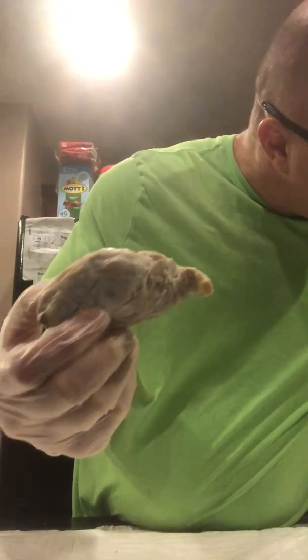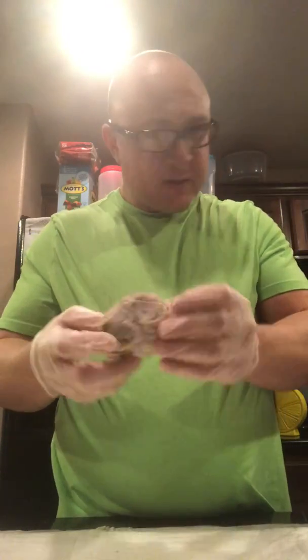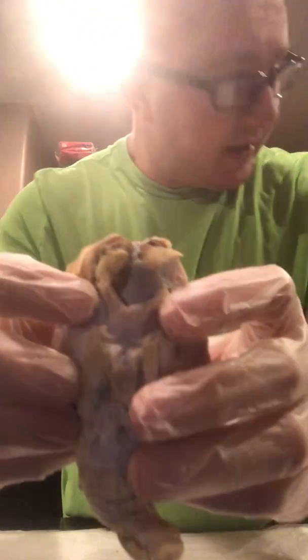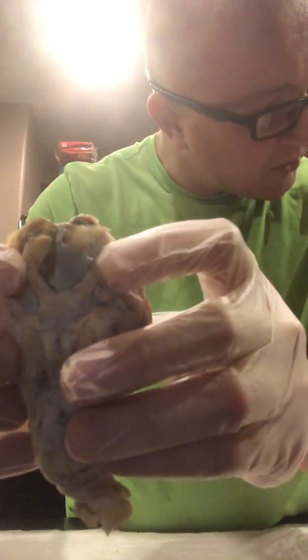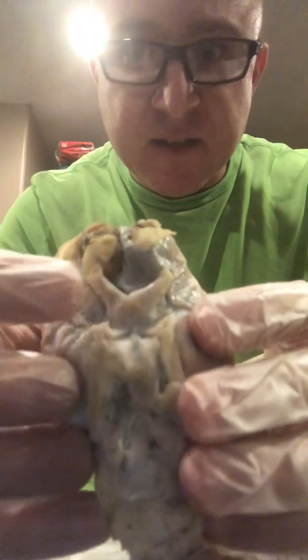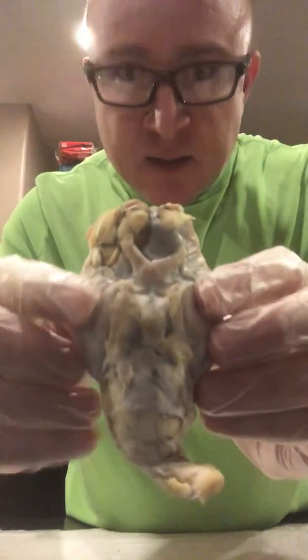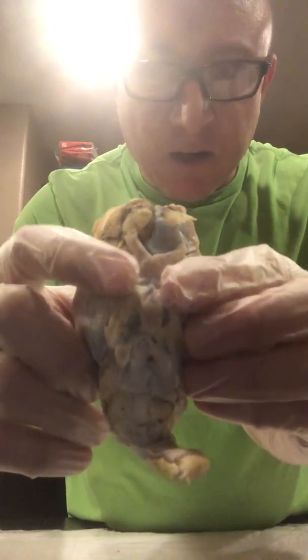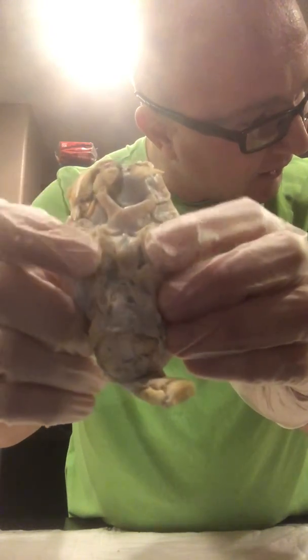So the cranial nerves is next. The cranial nerves, we have the olfactory here, the olfactory nerves. The bulbs are going to be the tips of these nerves here. The next is the optic. So the optic nerves will be roughly out here that branch off of the optic tract here.